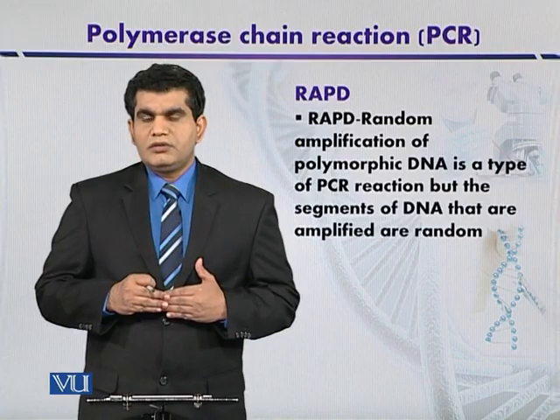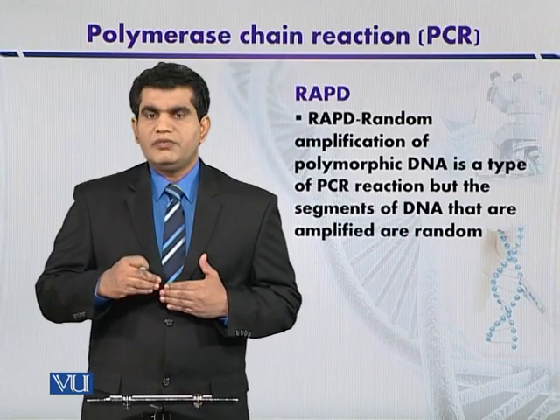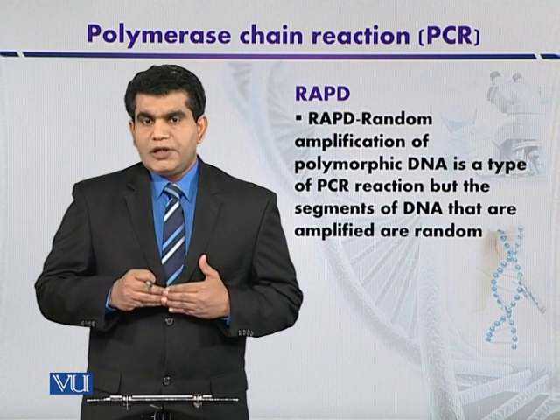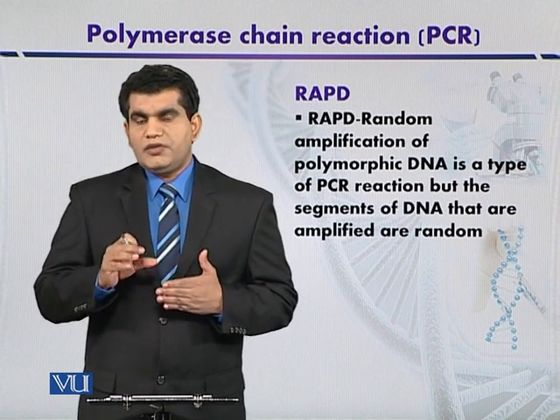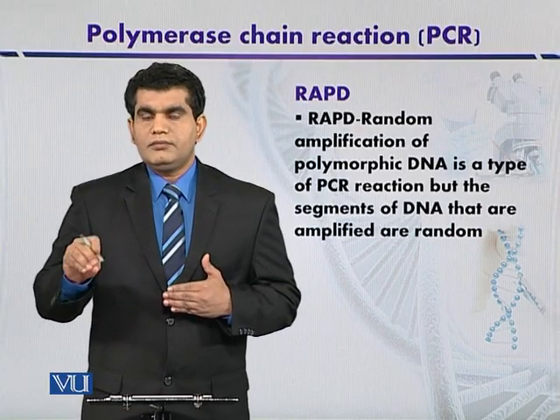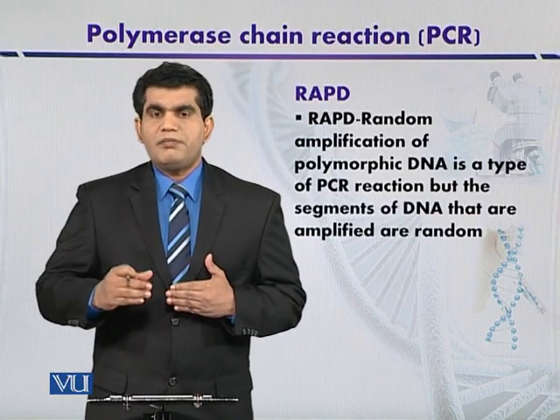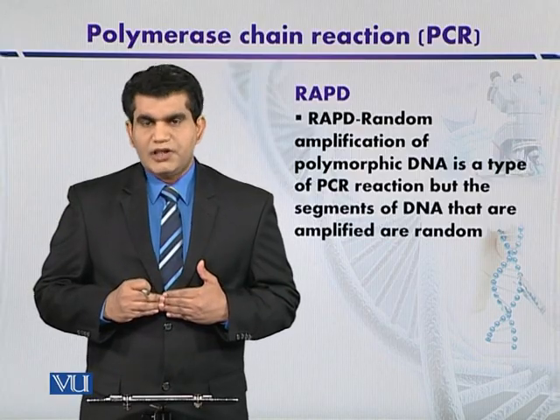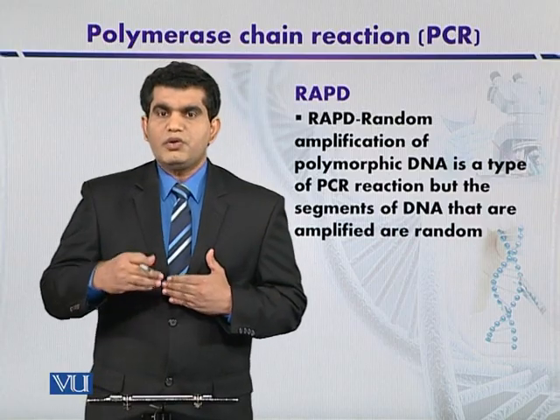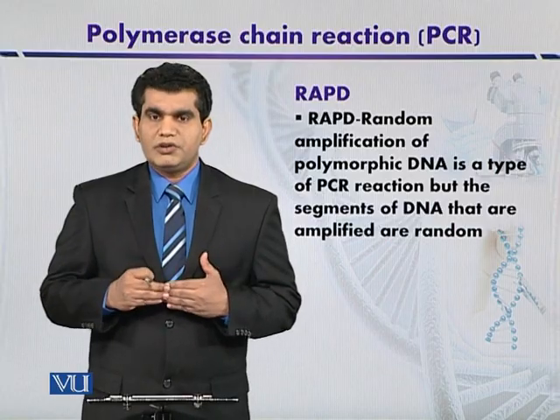and again evaluated it using the same primer set by RAPD. It is not necessary that the second time we will get the same banding pattern as the first time. The reason may be that with the passage of time, mutations may occur within the genome of that organism, so that the target site for the primer is missing. It anneals at another location within the DNA, so you can get a different banding pattern next time. That's why its sensitivity or reproducibility is not sufficient to find evolutionary relationships.